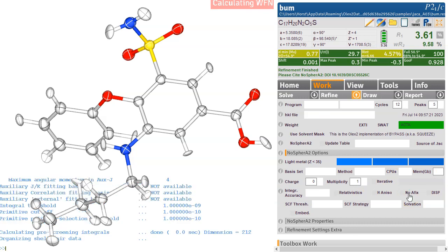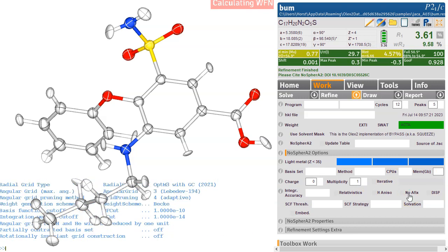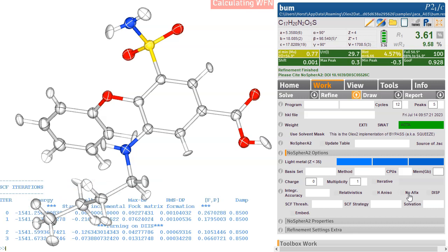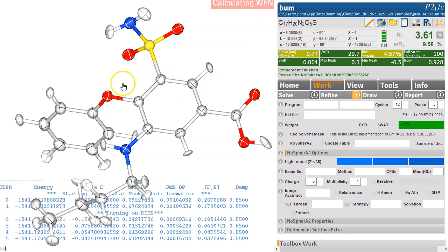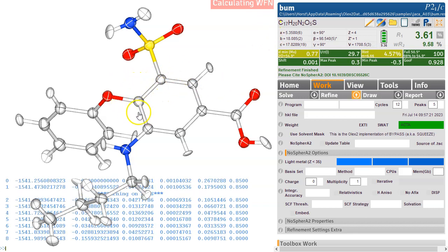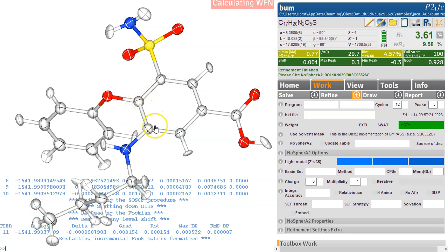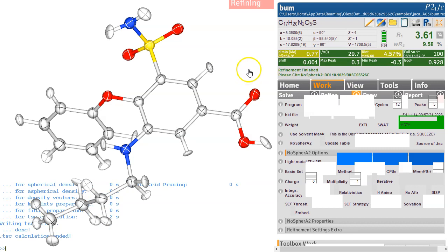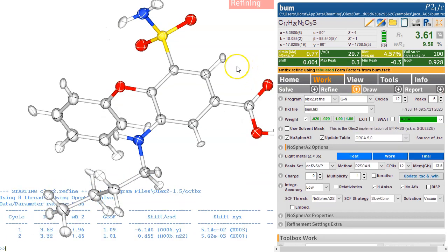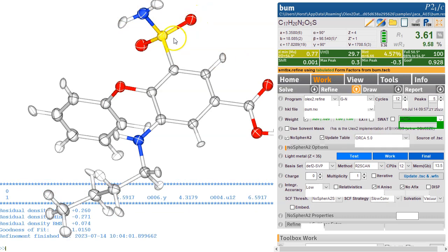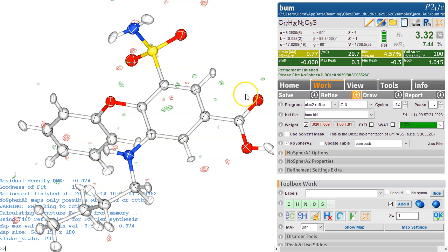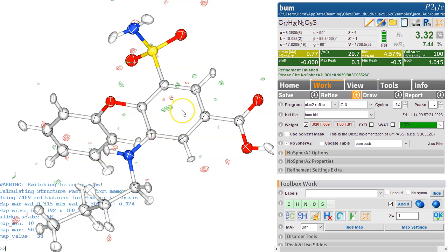So we are not using any more parameters than we have in the independent atom model, except the form factors are now calculated specifically for each atom. So this carbon has got a different form factor to this carbon because it's bound differently. And we're taking the bonds into account. So the residual density map should have or will have very few residuals, they're going to be very, very low residuals. We have the positions of the hydrogen atoms correct, we've got much lower R factors. So Control M, it's hardly any residuals left at all here. So it's really very clean.